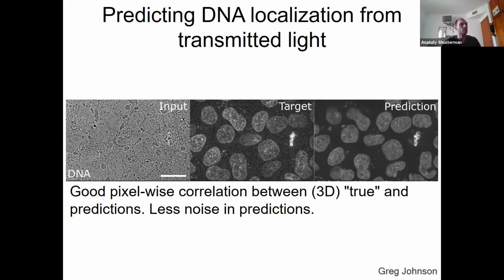Exactly. Think about it. As a model, we're trying to capture structure within our data. Noise has no structure, right? It's assuming that it's random noise. Most of what we see here in the background is just random background noise. So the network cannot learn that, which actually comes to our advantage because now we can generate nicer images, which are even better for post-processing, right? So in that case, yeah.